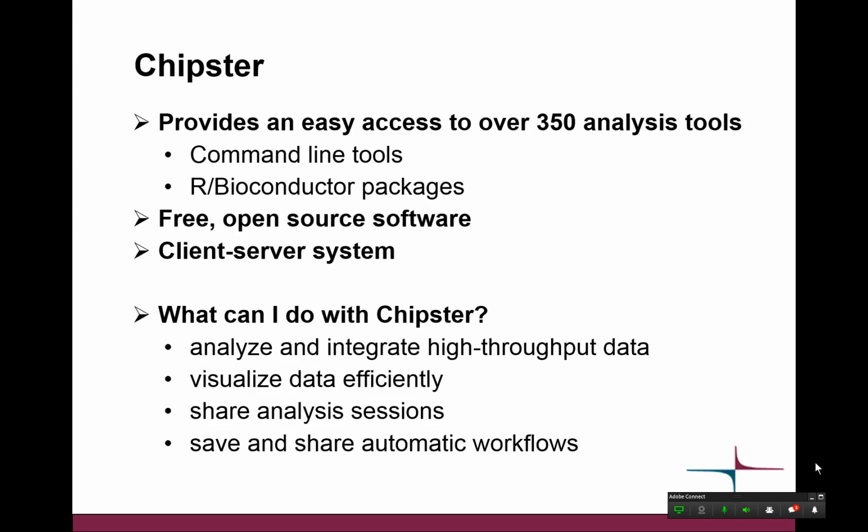So, like some of you might know already, Chipster is a free software developed at CSC, and it gives access to hundreds of analysis tools. So we don't invent the analysis tools ourselves, but we just take ready-made tools and put them behind this easier to use interface.